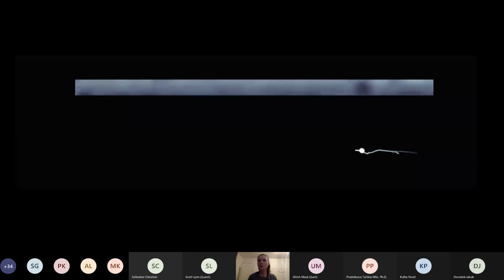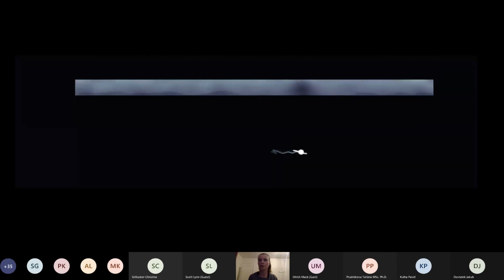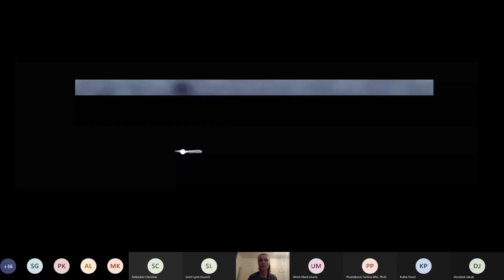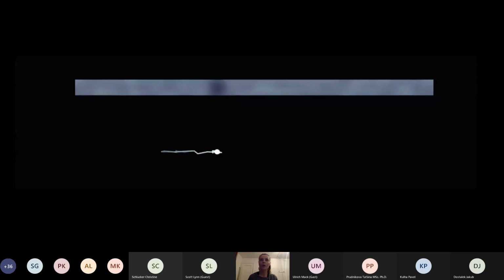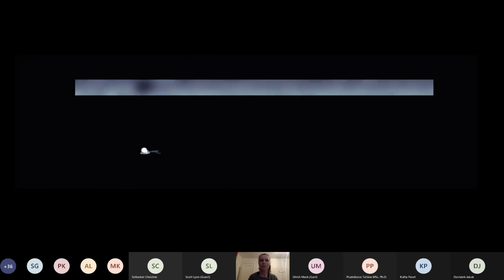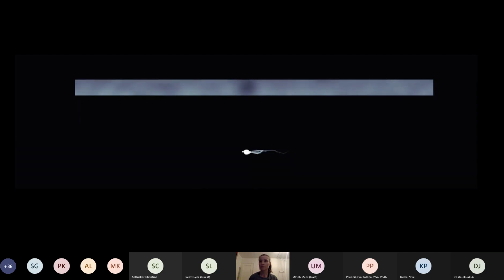Like, for instance, this is a video of a ferritin molecule. It's a molecule that has 400 kilodaltons, and this molecule, as you can see, freely moves inside a nanochannel. The movement you see is basically a Brownian motion of the molecule. So in this example, we don't push the molecule from one end to another. We just basically let it diffuse.